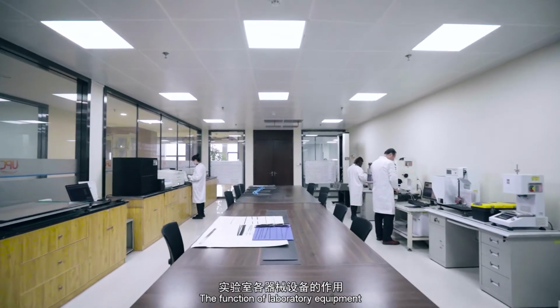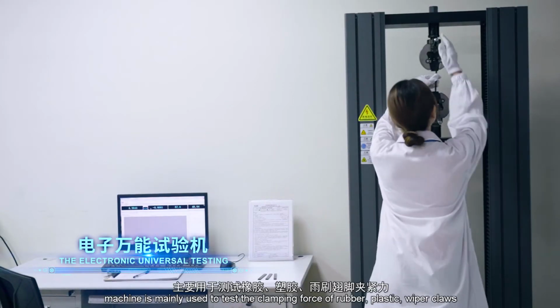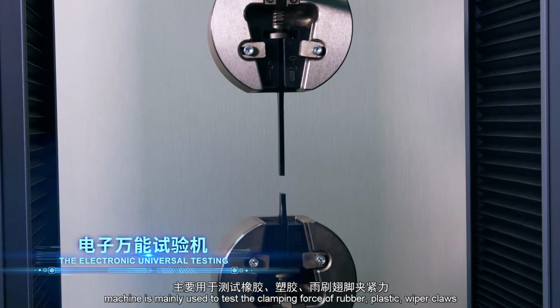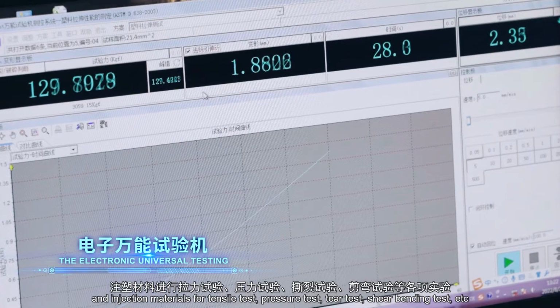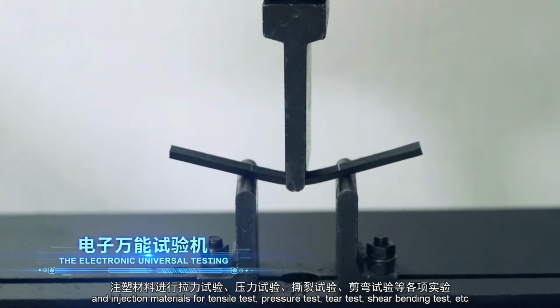The function of laboratory equipment. The electronic universal testing machine is mainly used to test the clamping force of rubber, plastic, wiper claws, and injection materials for tensile test, pressure test, tear test, shear bending test, etc.